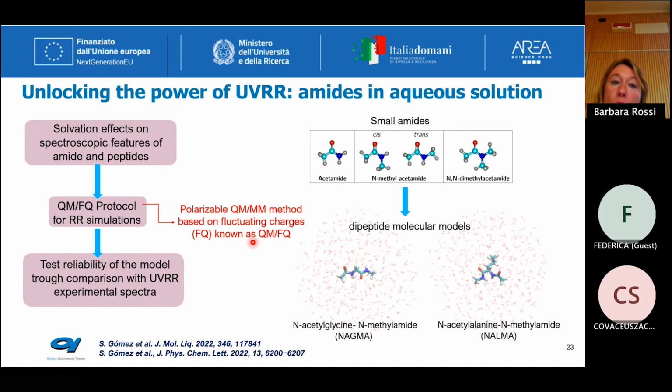They developed a code, in particular a quantum mechanical model, to reproduce experimental spectra, also Raman and resonance Raman spectra, of molecules in solvated state.